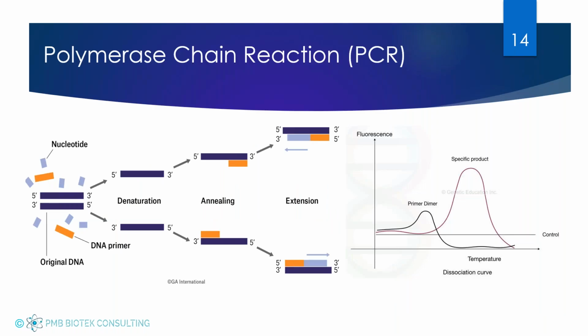And then came PCR, and the idea behind taking bacterial DNA or fungal DNA, splitting it, making copies of it, and then repeating that process over and over again, but tagging those copies so that it starts to fluoresce at a certain concentration, allowed us to really rapidly detect whether an organism was present in a sample.